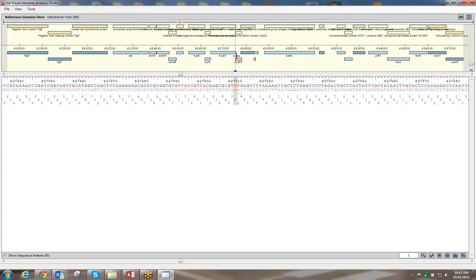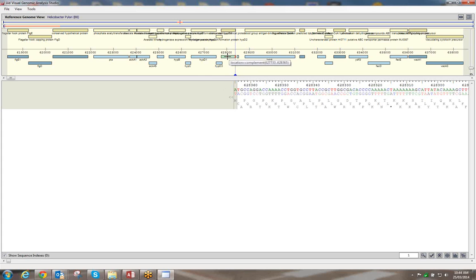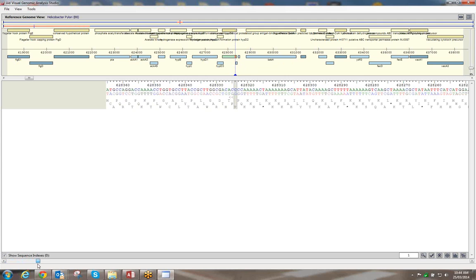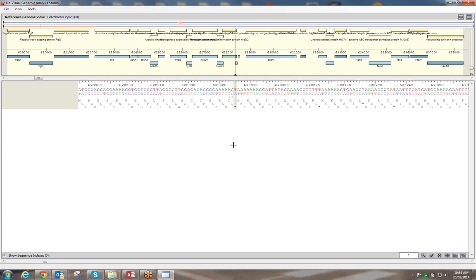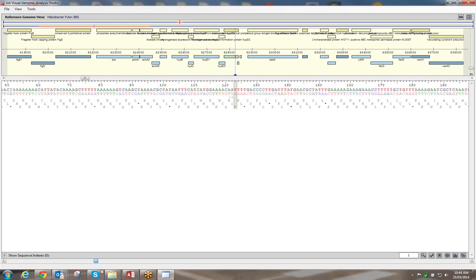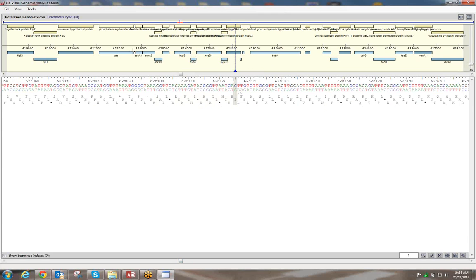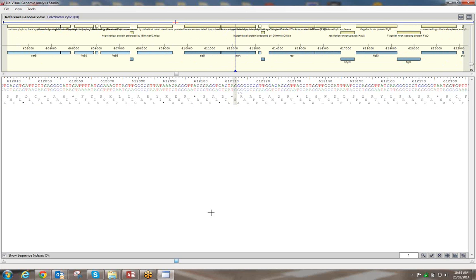If you double-click on the dark blue gene, you're actually going backwards along the complement strand, because the gene is coded in the opposite direction. So the complement strand is what's coding that gene — the numbers go backwards. But if you change the display to nucleotide position, you're going forwards. The same applies to the yellow coding sequences — the darker yellow is the complement strand.